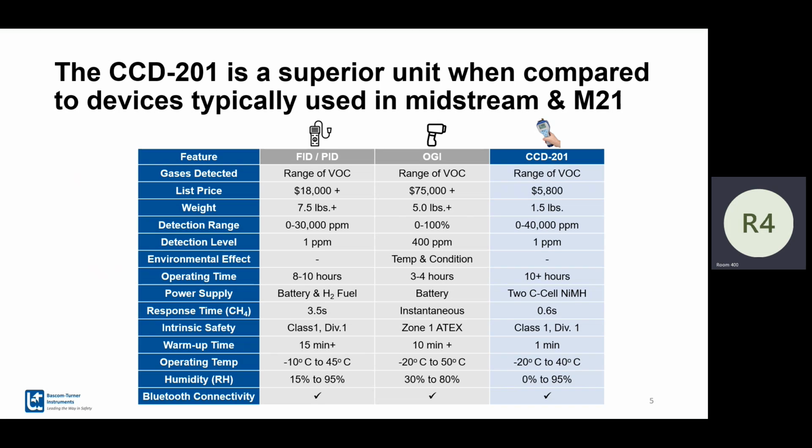But the rules require us to go more than 2 points. Yeah, we have to put that in. Again, we're new to this space. You can add this, you can do however many points you want. We just don't do it because it adds no value to the measurement. So if a customer wants it, we can, okay, use your 10 gases, whatever span you want.